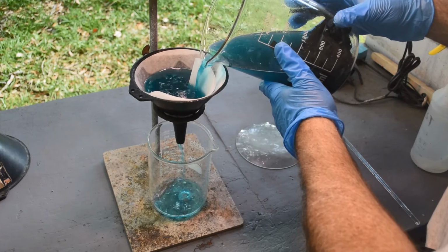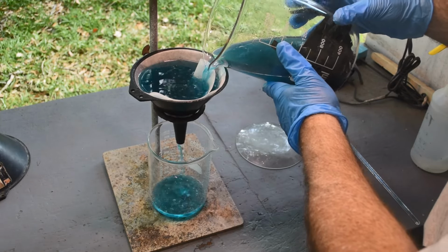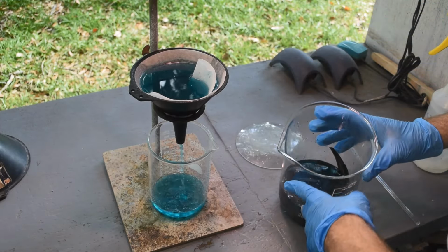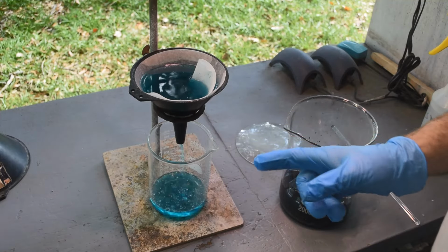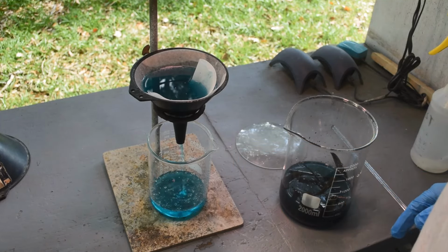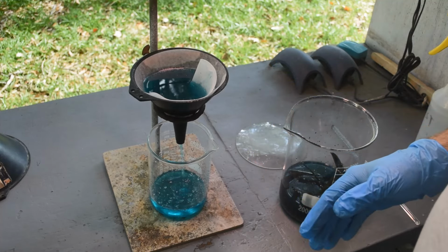Now this liquid, I could do a stannous chloride test on it, and I will probably do that later just to be sure. But it probably does not contain very much palladium in it because I still see free copper in here. But whether I detect a trace of palladium in it or not with a stannous chloride test, this liquid is going to go into my stock pot. So if there is any palladium in it, that'll wind up in my stock pot rather than in my waste bucket, okay?